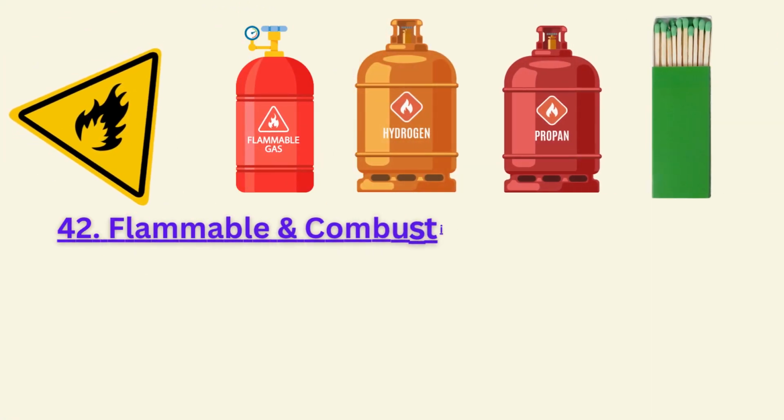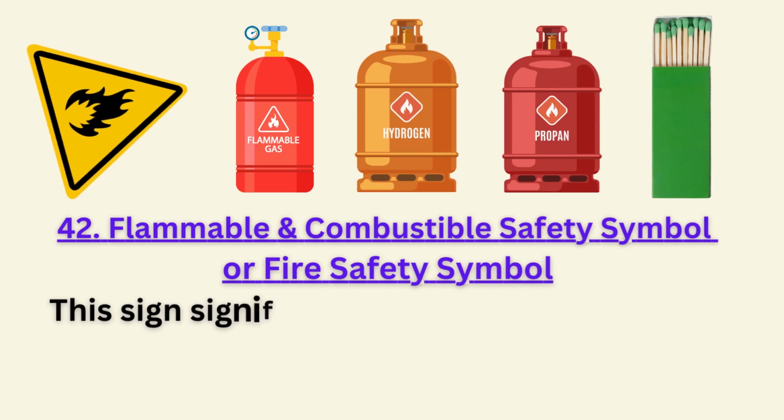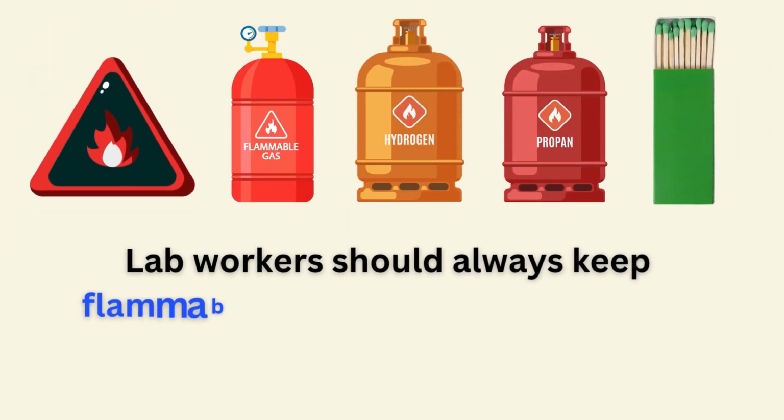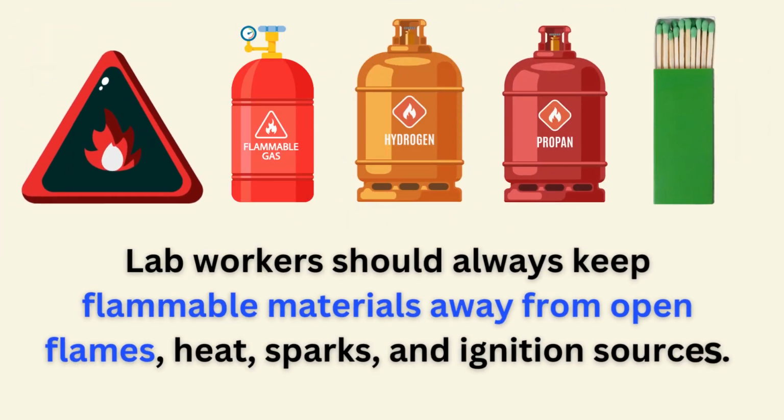42. Flammable and combustible safety symbol or fire safety symbol. This sign signifies substances that will ignite and continue to burn in air. Lab workers should always keep flammable materials away from open flames, heat, sparks, and ignition sources.